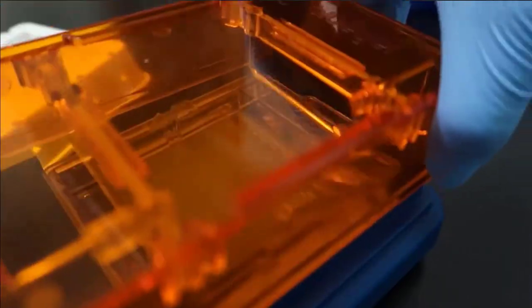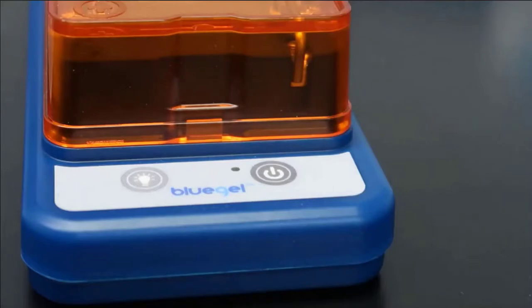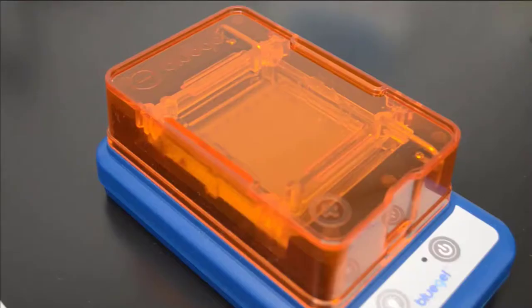Once our samples are loaded, we will close the lid and turn on the power. Here, we're using the blue gel from MiniPCR Bio, which combines an electrophoresis chamber and visualization system. The blue gel will take about 20 minutes to run. Once the gel has run, we need a way to visualize our DNA.